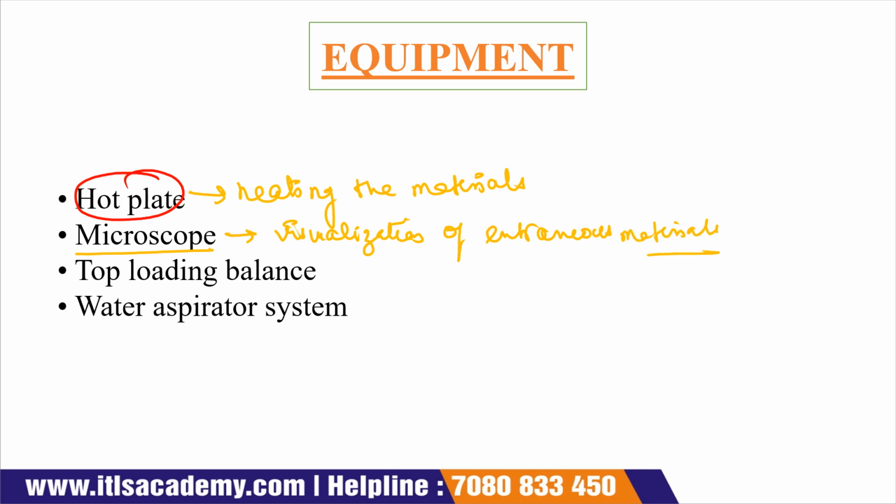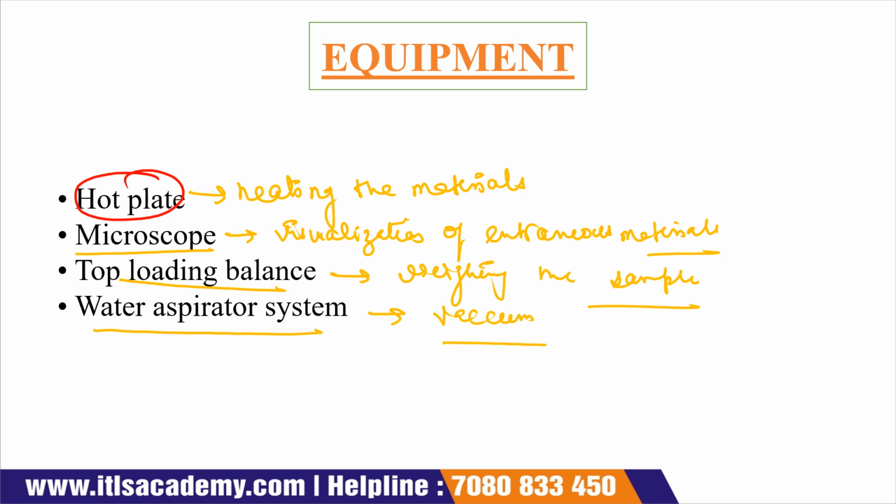Okay, a top loading balance is used for weighing the sample. And at the end we require a water aspirator system, which is required to carry out the vacuum. So we require a hot plate, microscope, top loading balance and water aspirator system.